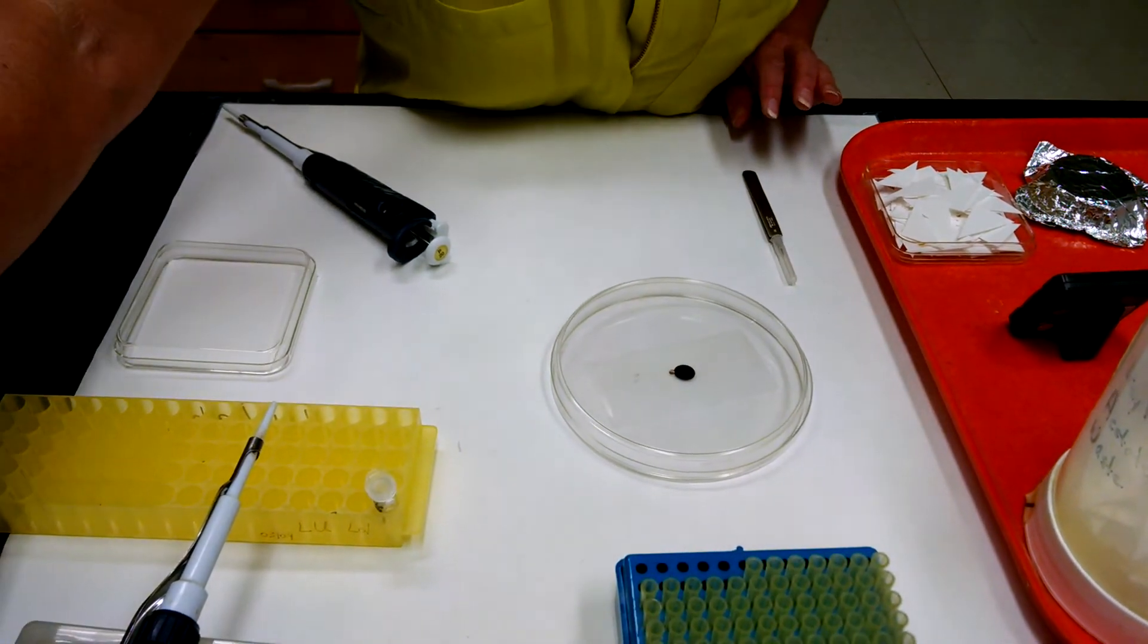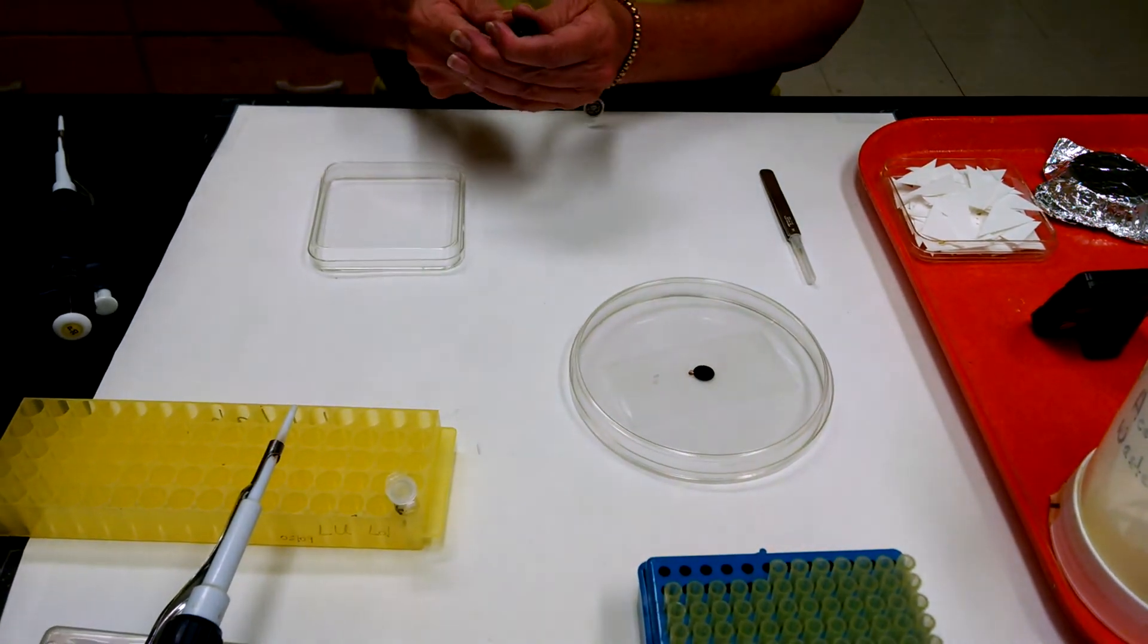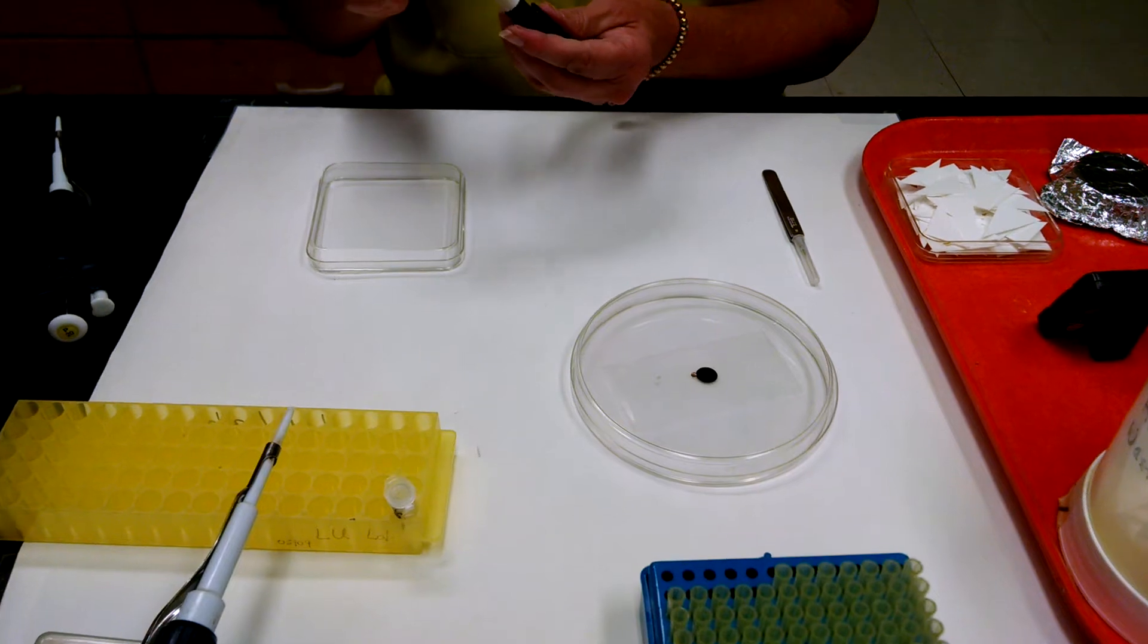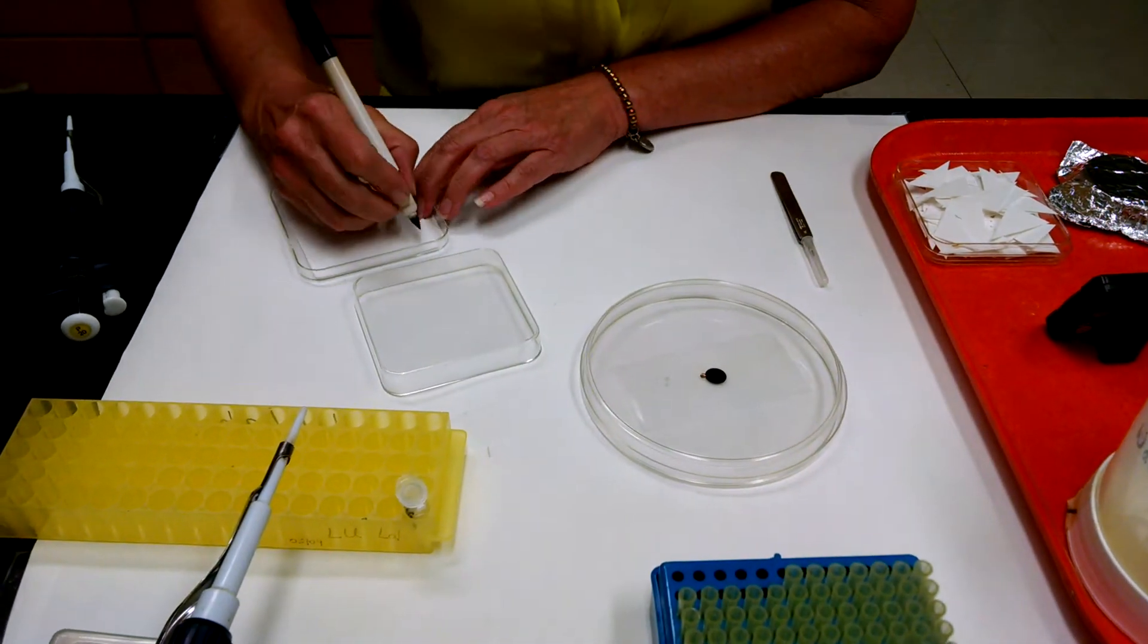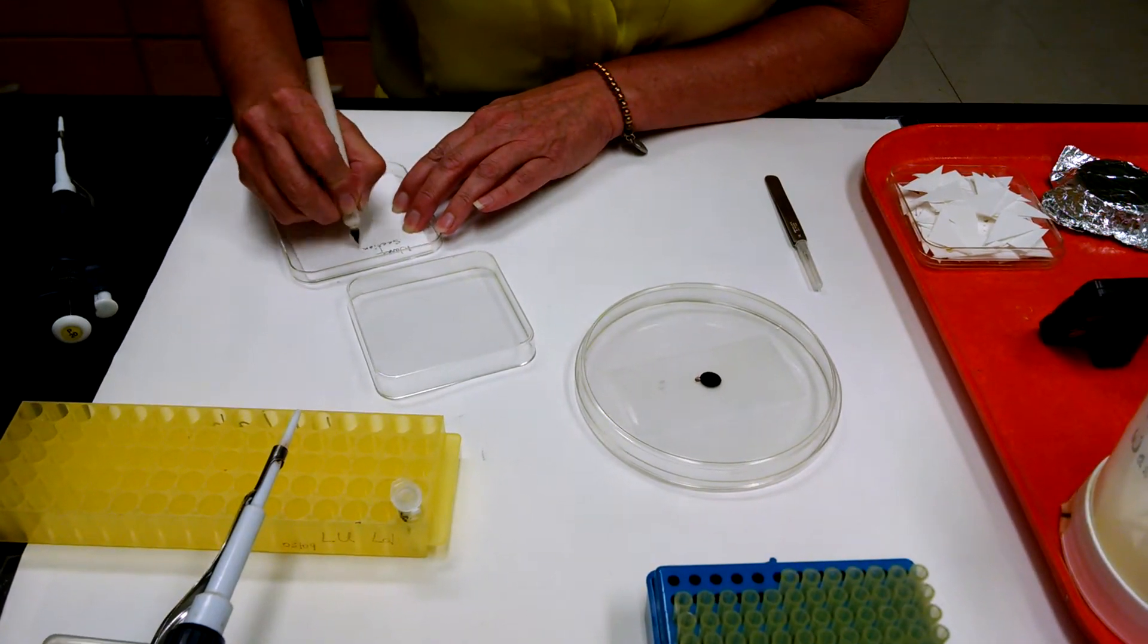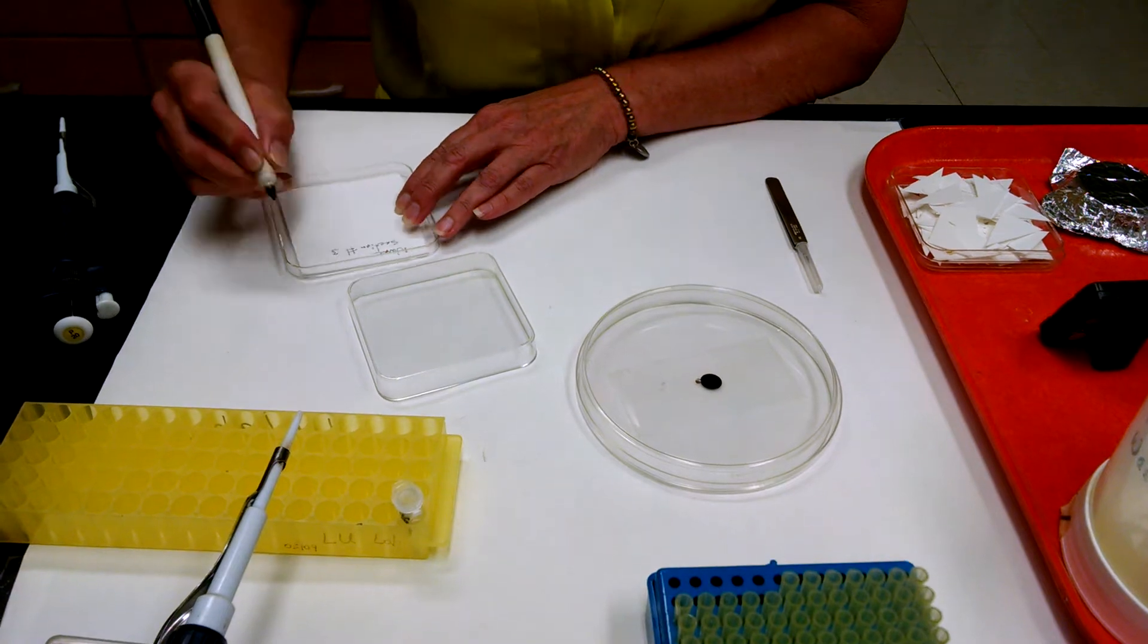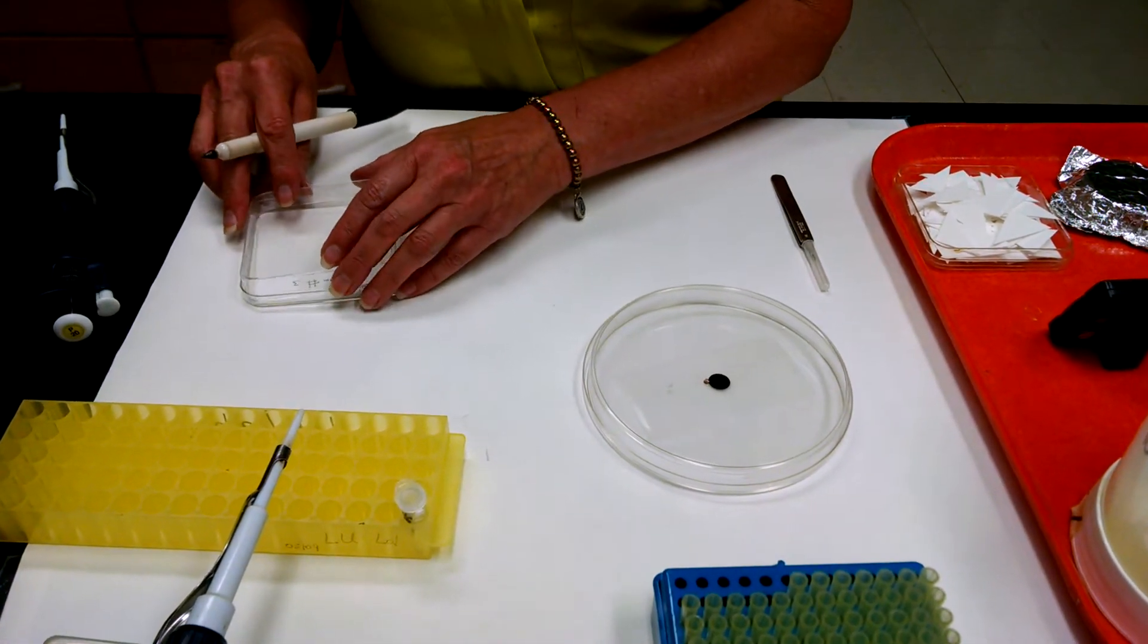During these three minutes what we're going to do is we're going to label this box that we're going to store the grid in. And what you're going to do is you're going to put your name and your section number. Now this is incubating for three minutes.